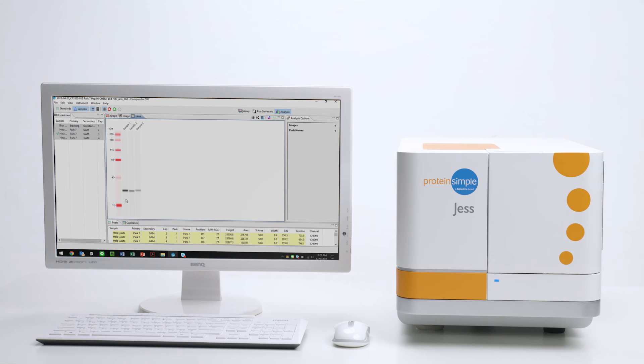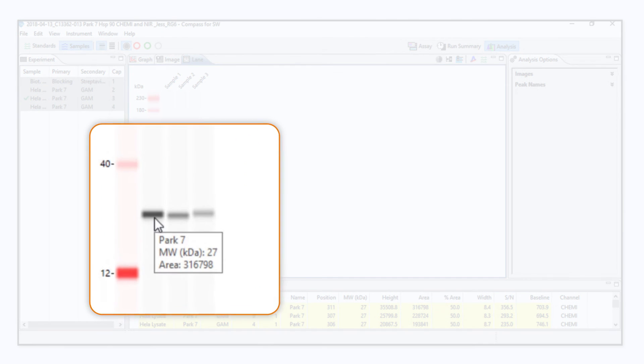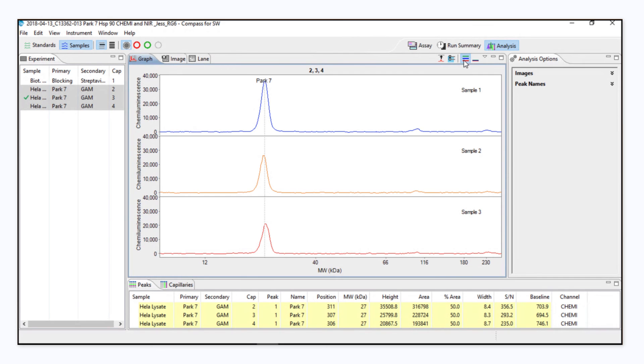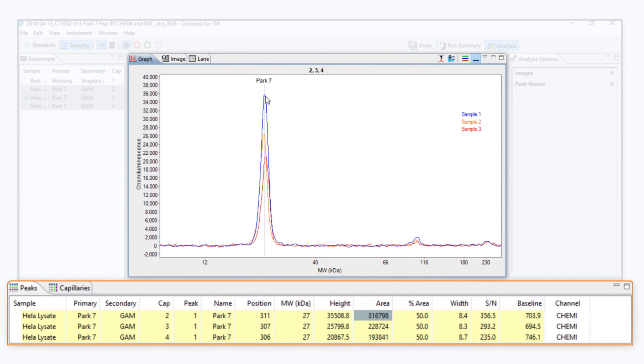Analysis is a breeze. Want to identify whether a protein is present or absent? Jess gives you the qualitative Western blot data you are used to seeing. Even better, she'll quantitate the data for you too. With a few clicks, you'll be analyzing immunoassay-like standard curves and precisely quantifying your protein.